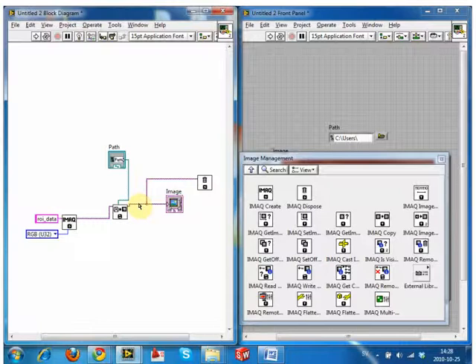But right now we'll have a competition on speed. It's going to be trying to display this image at the same time that it's trying to delete the image from the memory. So that's not what we want. Right now we'll have a competition, and that's never a good thing. You'll kind of see. Does LabVIEW allow it? Yeah, it's totally fine. If you look up here, it says totally runnable VI. It'll be a question of which one's faster, destroying it or showing it in this format.